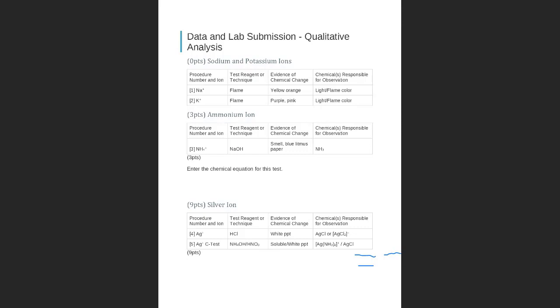I won't write all of them because you actually have them, so I'm not going to waste your time. So this is a simple report. Not all reports are like this. Some reports will take a lot of time from you, with calculations and use of Excel, but this one is just to look at the reactions.